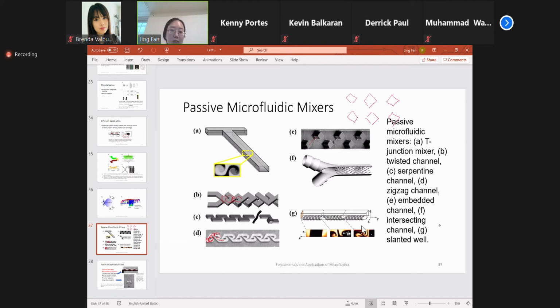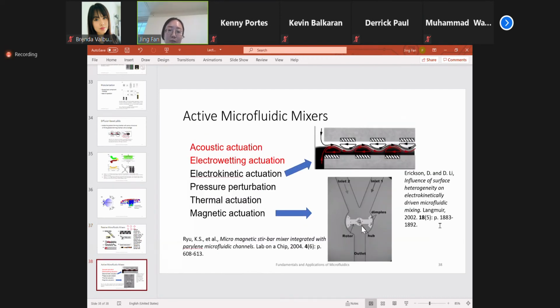Next, we're gonna discuss active microfluidic mixers. Are there any questions about the previous slide?